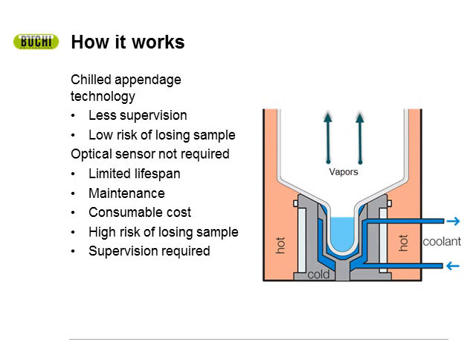For example, let's say you're evaporating off dichloromethane, with your recirculating chiller set to 5 or 10 degrees Celsius. Once it gets down to this mark and you have your gradient program set up, the system will aerate itself and take it back to atmospheric pressure, which is roughly 1,000 millibars, depending on what geographical region of the U.S. you're located in.